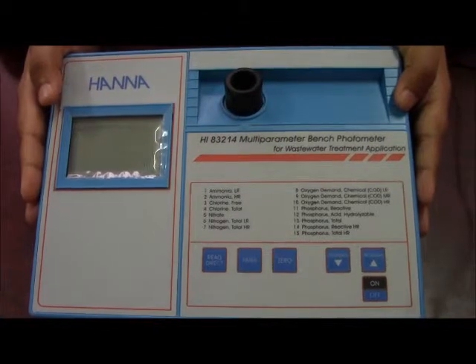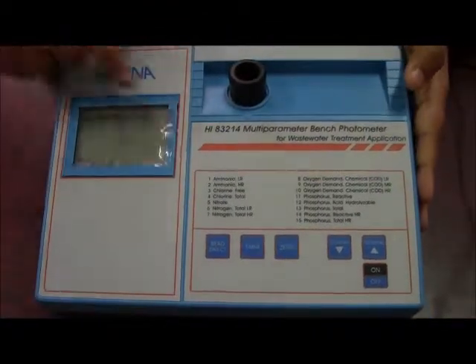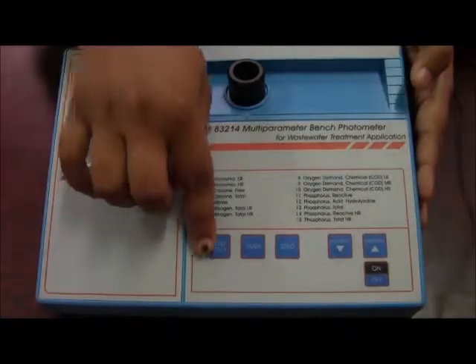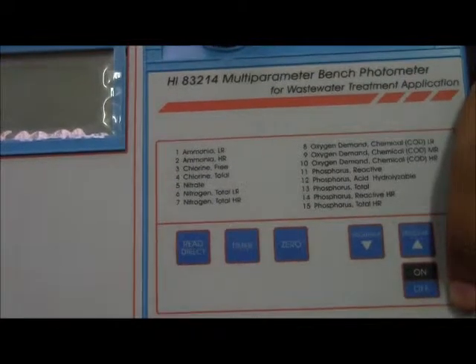This is HANA HI83214 Multi-Parameter Bench Photometer. This is its LCD display. These are its functional keys and these are its two navigation keys. This is its on-off button.